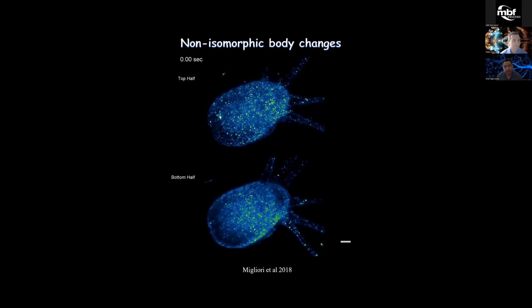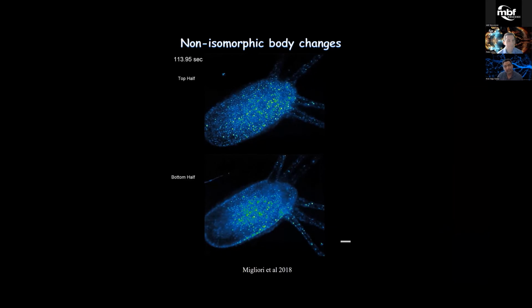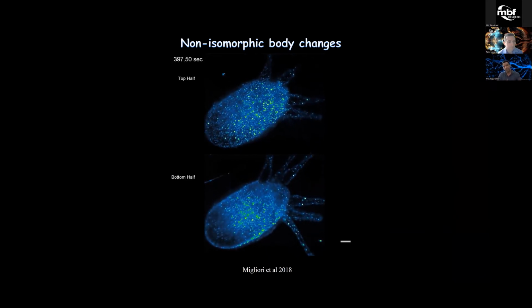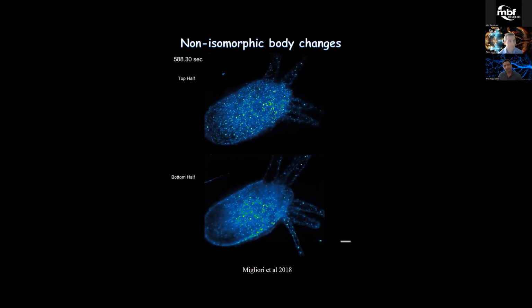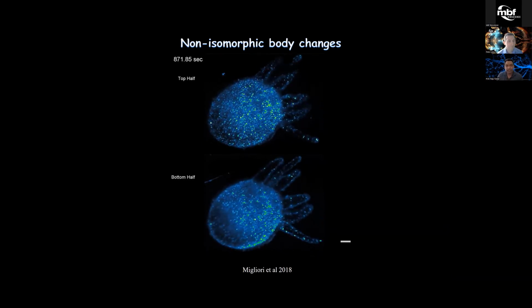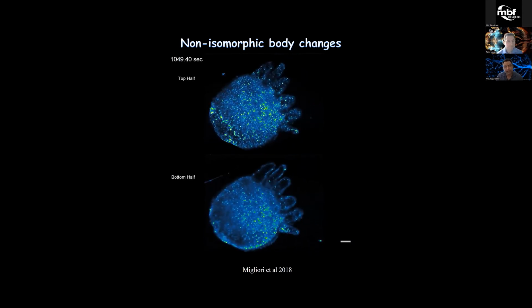Okay, so beyond cleared tissue, this kind of geometry also provides advantages for other kinds of samples, especially in the live imaging context. So this is one of my favorite examples, worked in collaboration with Rafa Yuste's lab. They have a project with Hydra, which is kind of a jellyfish, where they have transgenic animals that express GCaMP, which is a label for neuronal activity. So we could do this live calcium high-speed imaging and correlate the neuronal activity with a freely behaving animal.